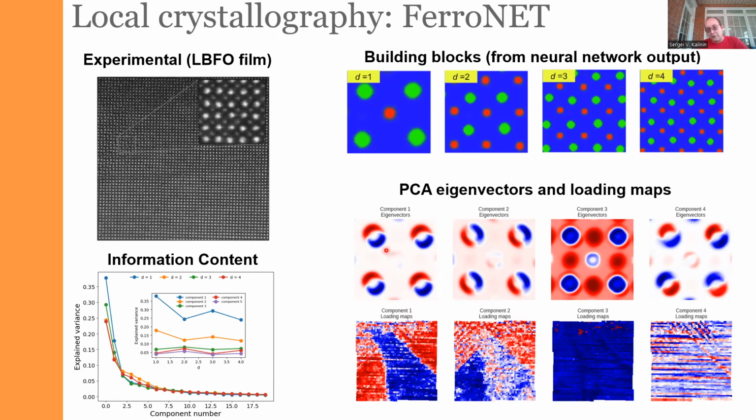So this shows us the component in the 1,1 direction, and this shows us the different component in the 1,-1 direction. And these components are independent. Then the interesting thing happens if we start to look at the higher components. For example, if we look at this component, you can see that it tells us something different. In this case, there is no polar displacement, but you start to see the oxygen atoms. So it's a change of the intensity of the oxygen.